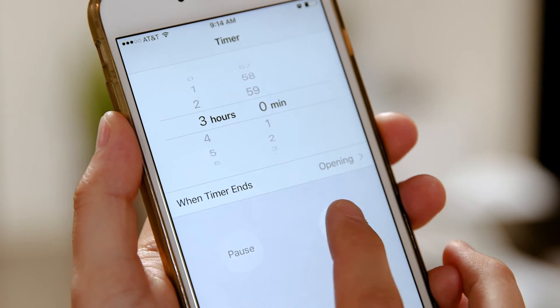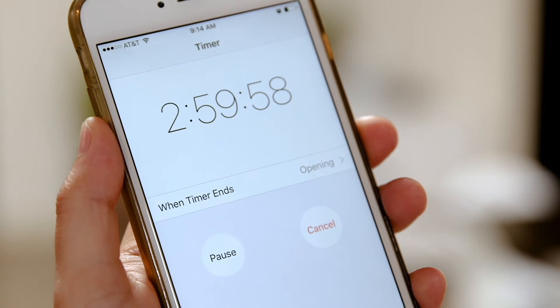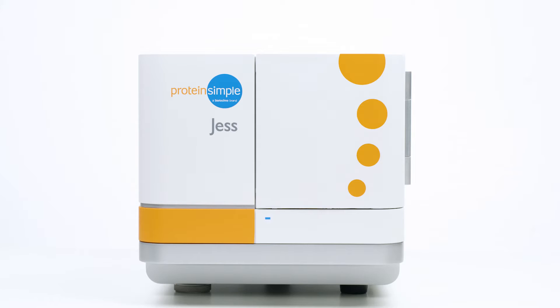Come back to fully analyzed and quantitated results in three hours. Jess — she's like Western blot meets ELISA in one.